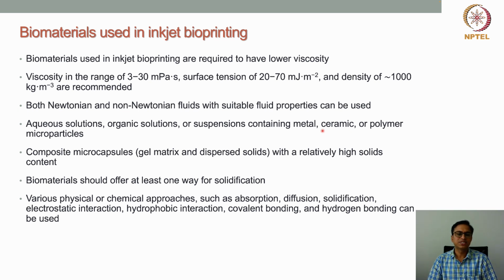Various physical or chemical approaches have been used to achieve the solidification process so that the structure gets stabilized. Something like absorption: after the generation of droplets and placing them on the stage or substrate, they should get absorbed very fast. In this way solidification can be achieved.